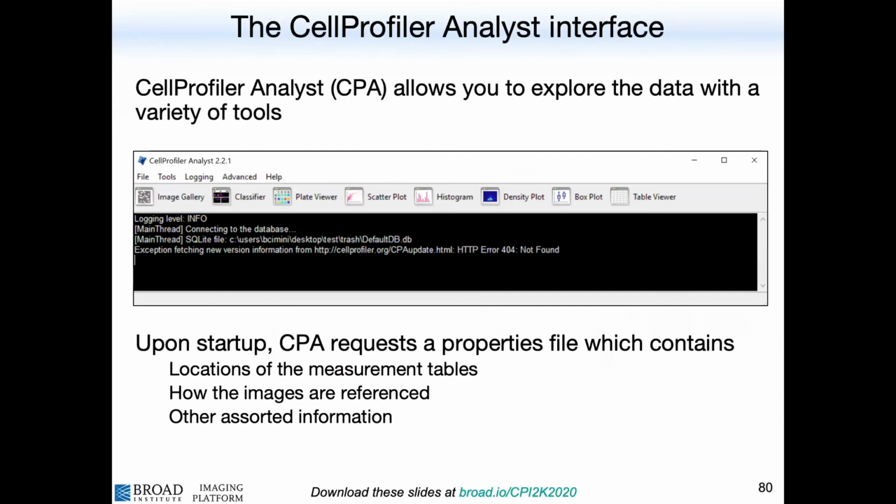Now let's take the data that you generated and answer the question that we care about, which is finding what dose of this drug causes translocation. Okay, let's now move to demo mode.